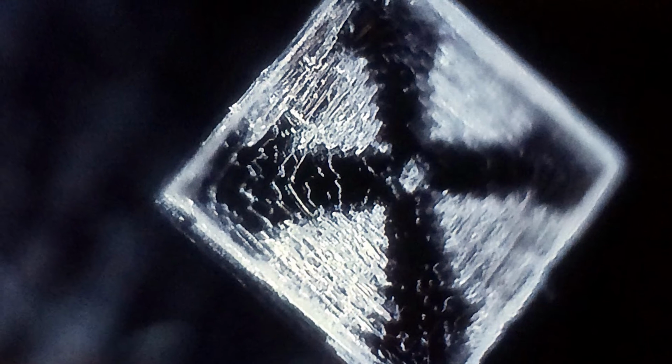I'm just looking at these ferning patterns, but still Inés wanted a crystal that you could pick up and put on our diffractometer and make measurements the way we make measurements on our antibody crystals. After a few months of work and a lot of conversations, a lot of exchanges of information and how we saw the different materials and what we were doing with these processes, we were able to grow a crystal from saliva. And eventually, to our utter amazement, one evening we actually saw this happen.